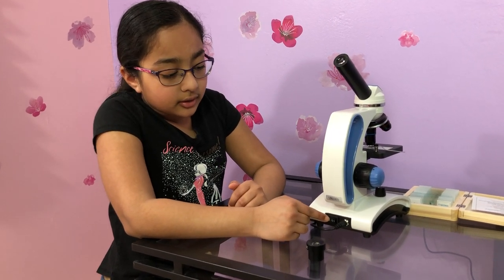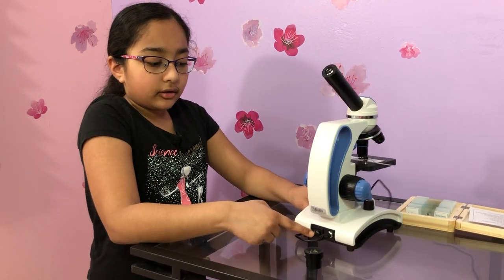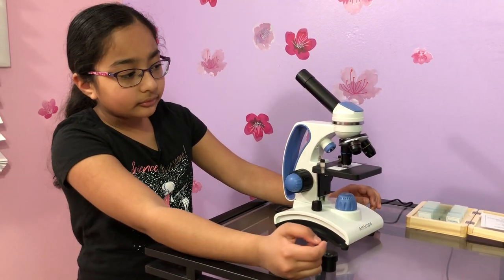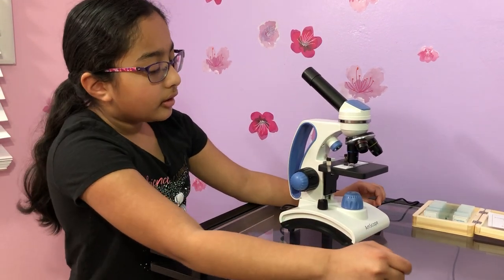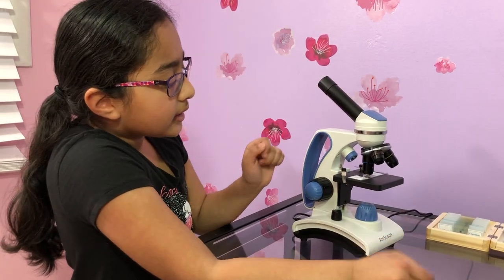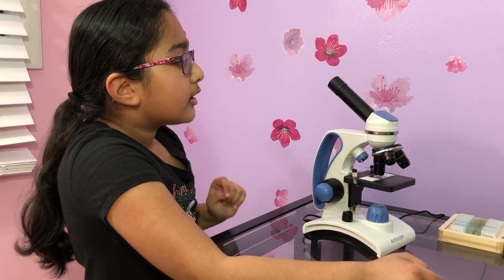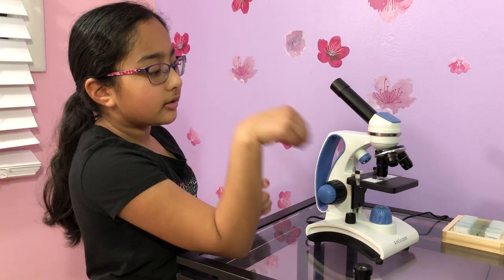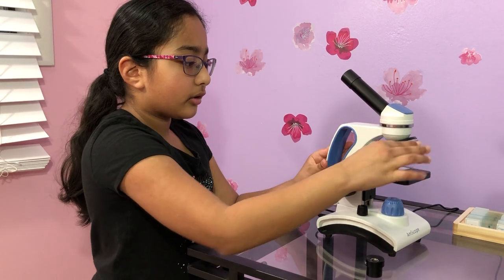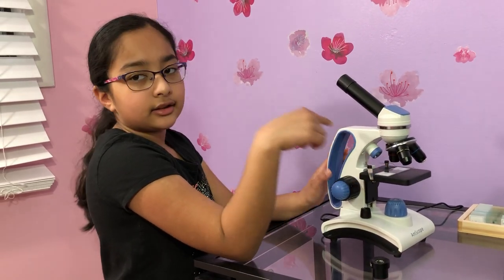The magnification is the eyepiece times the objective lens. So if the eyepiece is 10 and I move the objective to 4, then 10 times 4 equals 40 magnification.